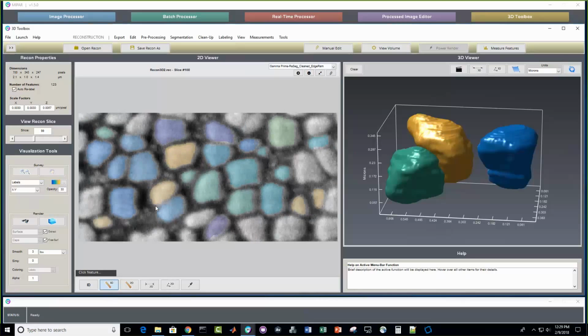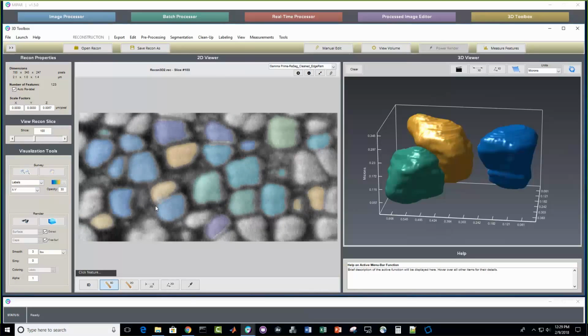I apologize that we didn't have time. We may do a dedicated 3D webinar at some point. We are also working on the ability for MIPAR to directly open 3D files. We should have that out in the next quarter, I would say. But right now, the way to get 3D data in is to have a series of 2D images that get assembled in the batch processor. And those can be any format over 140, like I mentioned before.